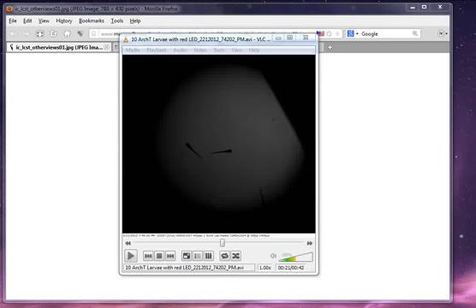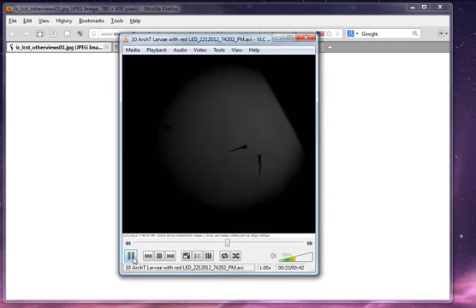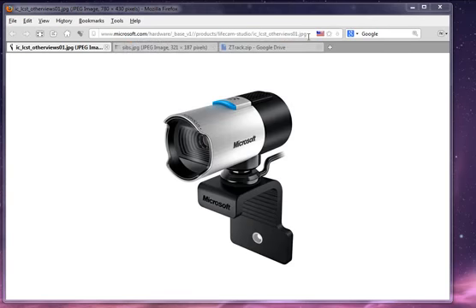Hello, this is a tutorial on how to use the zebrafish tracking program that I made. The movie here is of 6-day-old larvae, and you can see that they swim and stop, and each one of those is called a scoot. The program will track each fish even if they collide and measure the distance of each scoot.